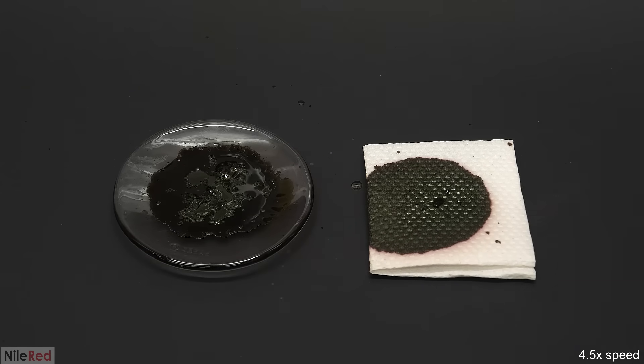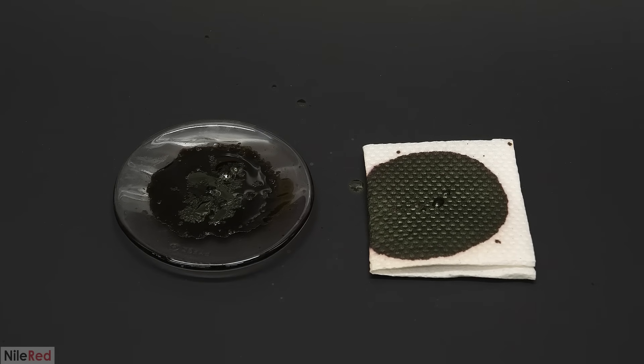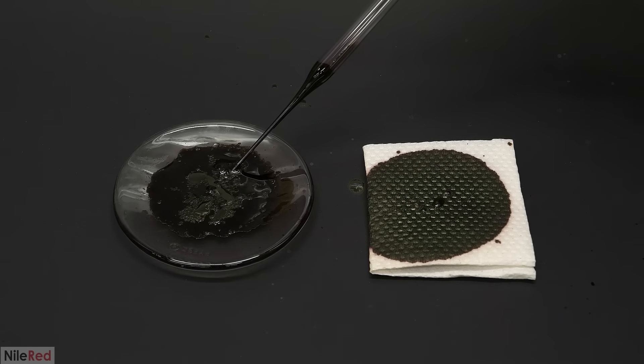I tried this again using one gram of permanganate and the same thing happened — it just kind of sat there for a while and then suddenly popped. The heptoxide in the dish did continue to decompose for a bit though, which I thought was cool.